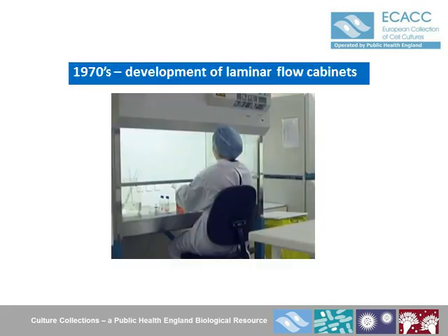It's also worth noting that none of today's tissue culture techniques would be possible without the development in the 1970s of the laminar flow biosafety cabinets that provide a safe and sterile environment for us to handle our cultures.